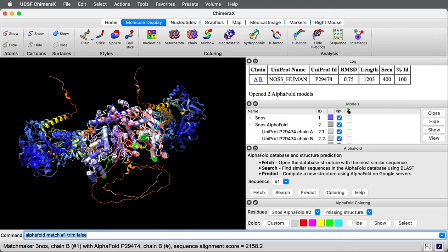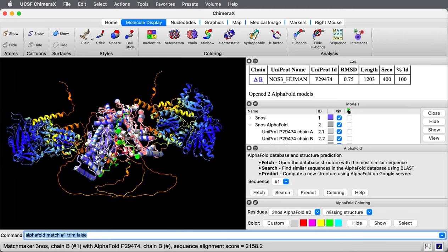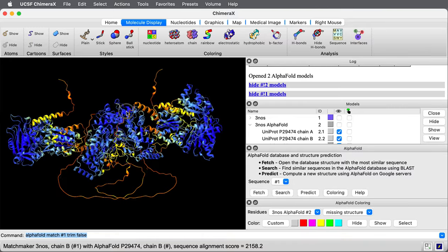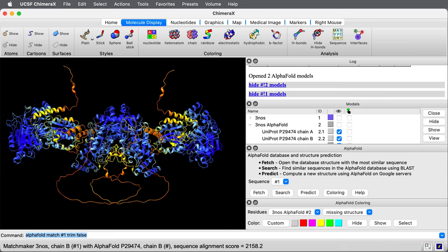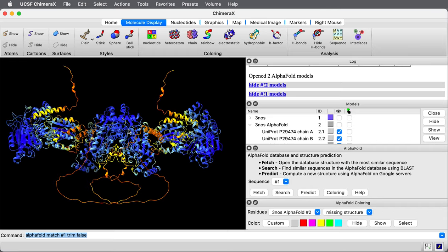This has loaded two more copies of the alpha fold prediction. Let me hide the other structures, the experimental one and the previous fetch. We see the middle domains were seen in the experimental structure.